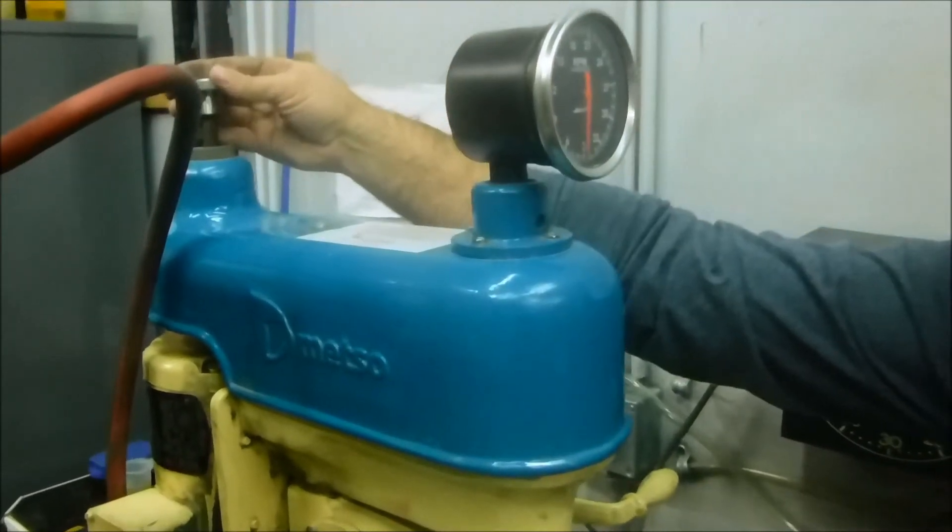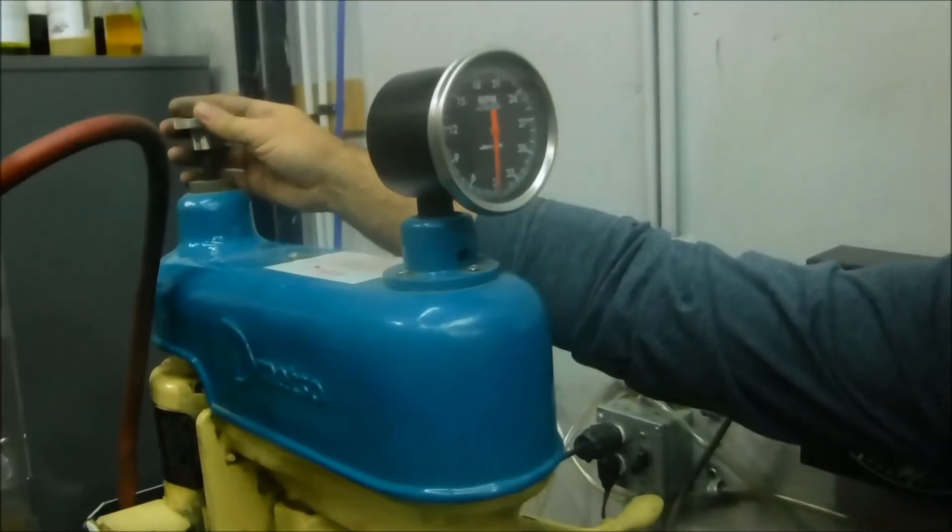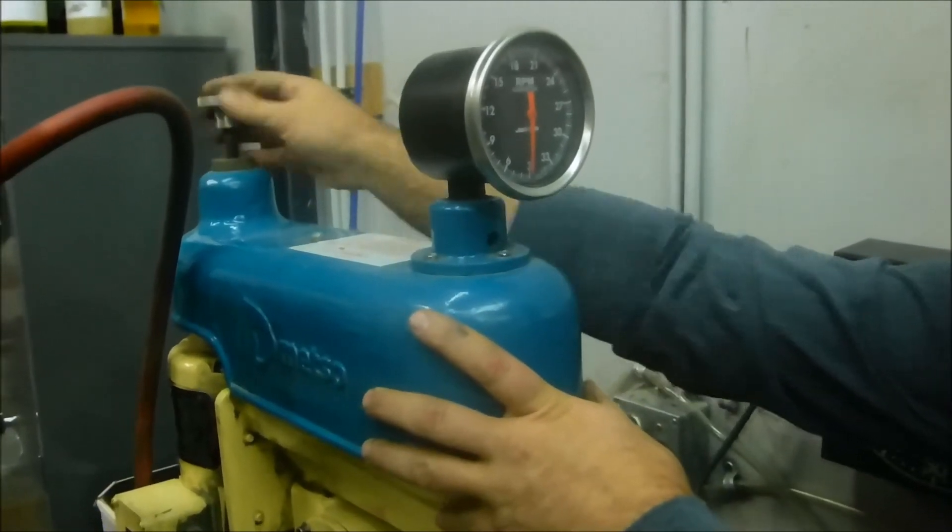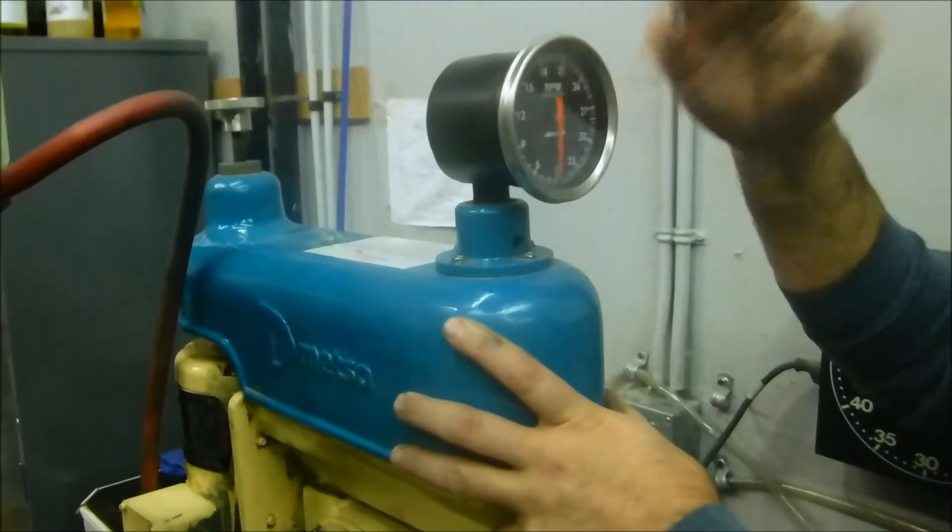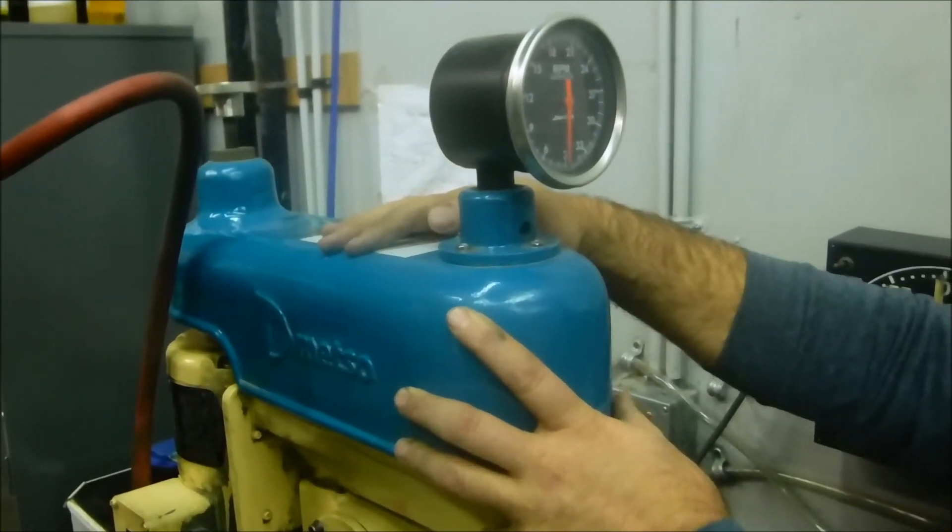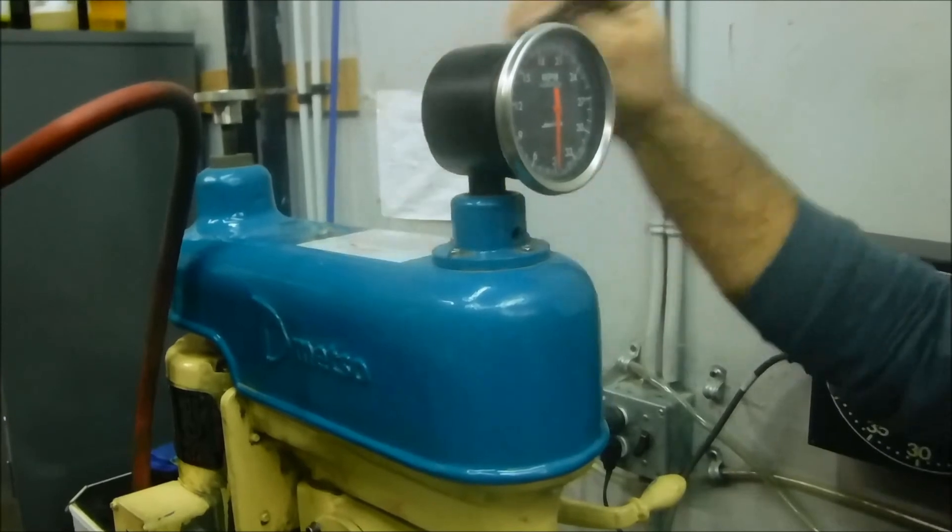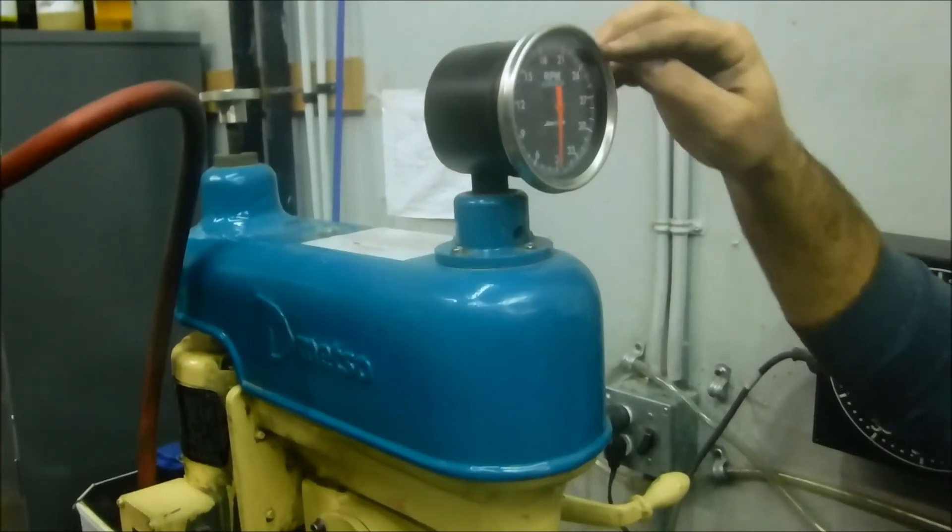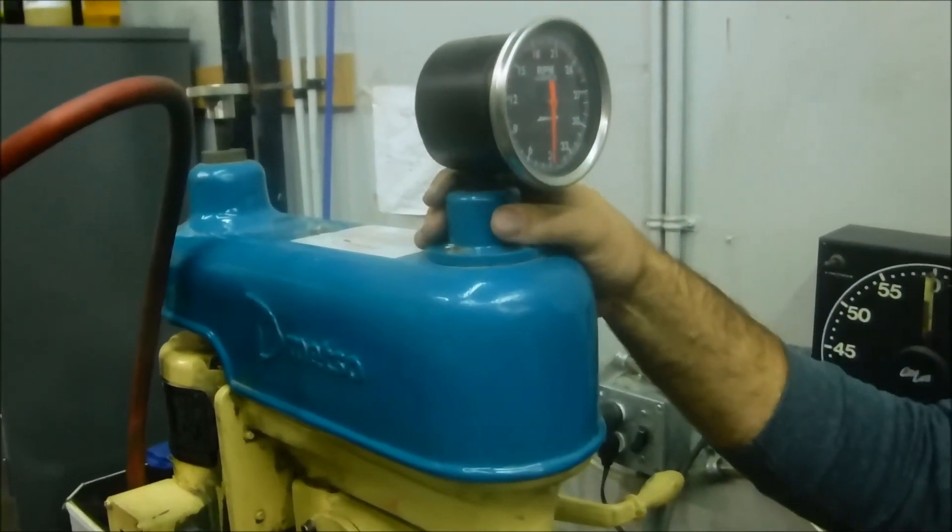You change the speed of the machine and agitator by changing this knob back here. We typically run between 900 and 1500 RPM on the agitator for most flotation work. As you can see, it realistically goes up to about 2400 RPM.